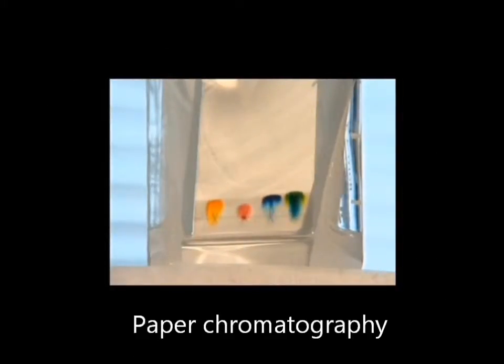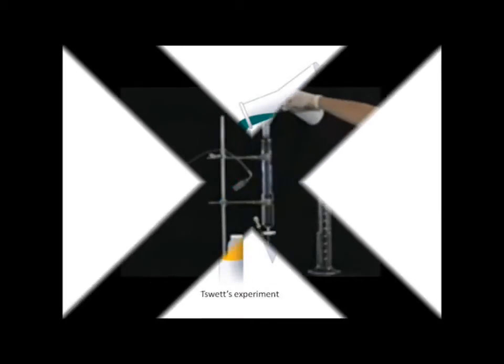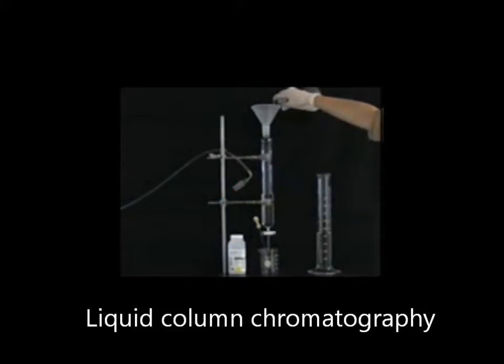Chromatography was defined in the early 1900s by the work of the Russian botanist Mikhail Svet. His study focused on separating leaf pigments using a solvent in a column packed with particles. HPLC is a highly improved version of liquid chromatography.